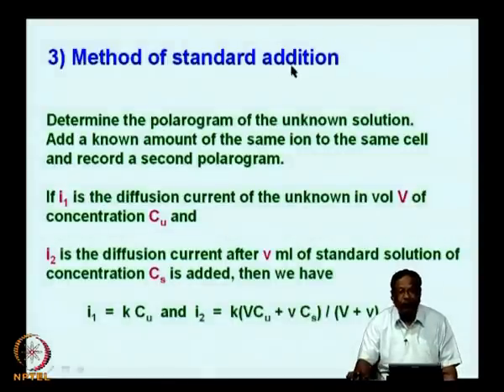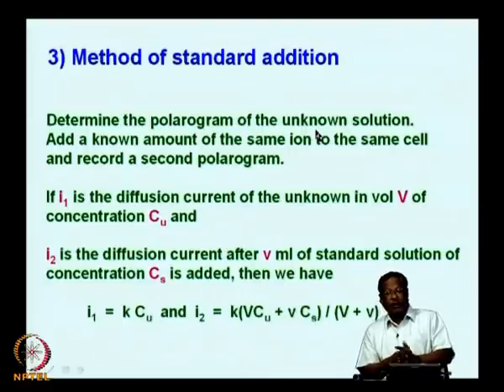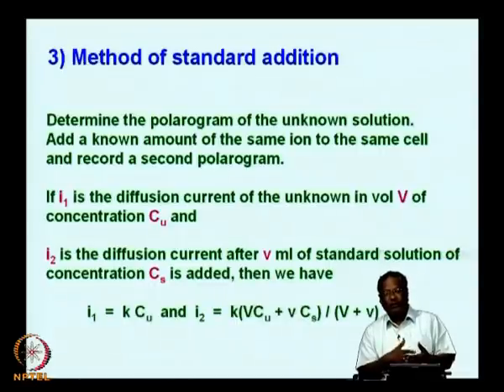And the third one is the method of standard addition. I have to tell you at this stage that the method of standard addition is not necessarily a prerogative of the technique we are discussing, that is polarography. The method of standard addition can be employed even in spectrophotometric analysis or hydride generation or atomic absorption or ICP or any of these. The principle remains the same. So, I am going to explain to you the principle of the method.